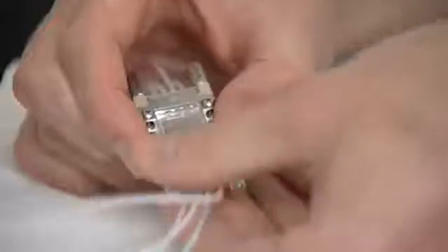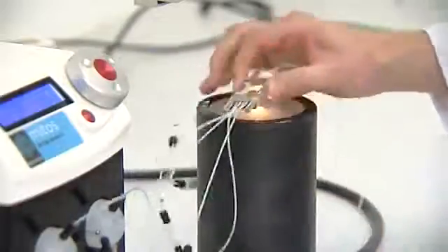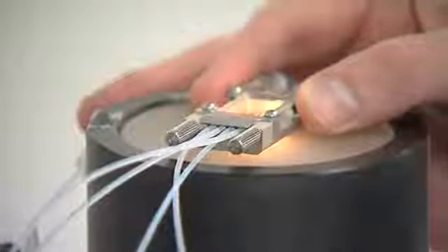Then the edge connector is fitted to the chip holder to create a pressure tight seal. The connector seals to 20 bar and is highly chemically resistant.